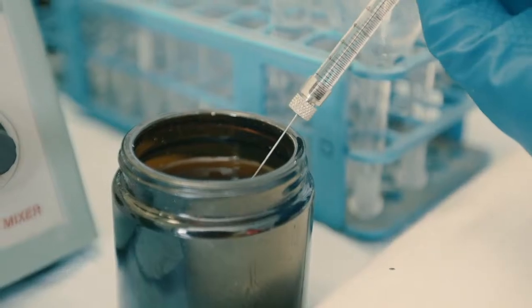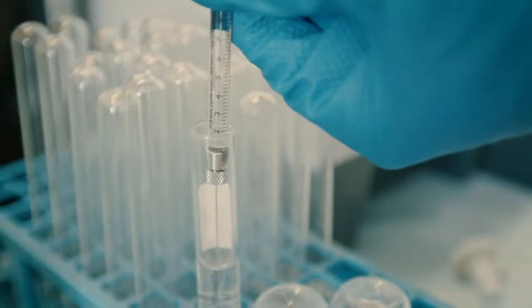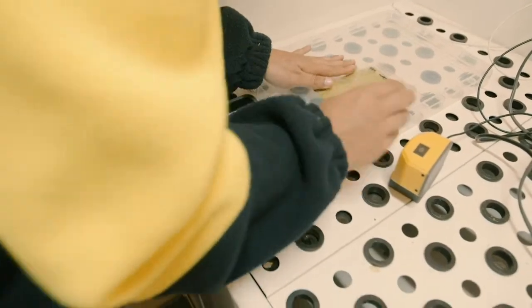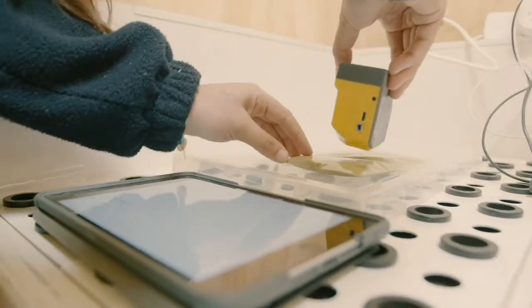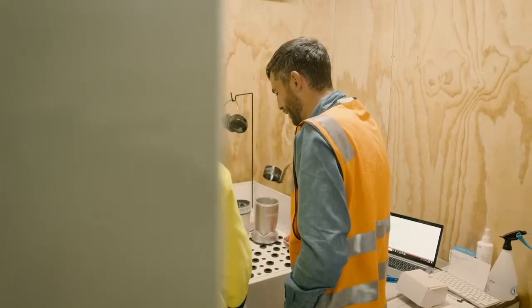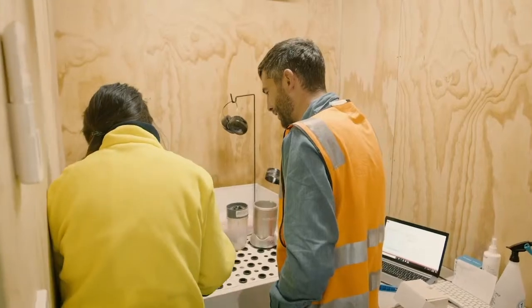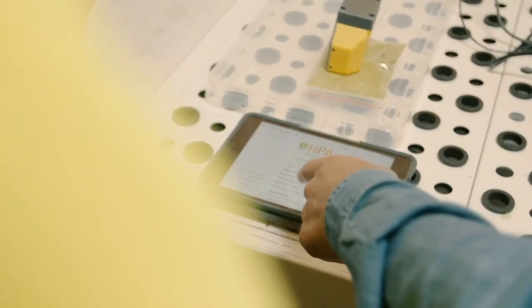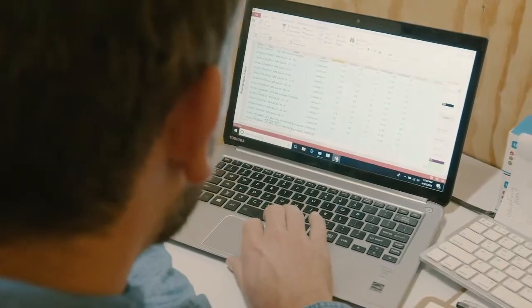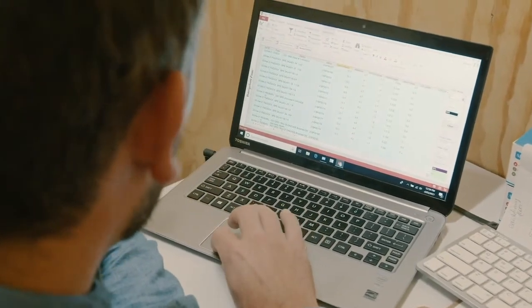But this is a relatively slow manual process that takes around 3 hours per auger sample, whereas NIR is faster, indirect, and only takes around 5 minutes per auger sample since no analyte extraction is required. So with the NIR, we've been able to increase the number of oil contents we can produce from 6 samples a day to 60. And we now have the capacity to produce oil content and HSI values for every bale during harvest on top of alpha content. NIR is also employed for all our pre-harvest analysis.